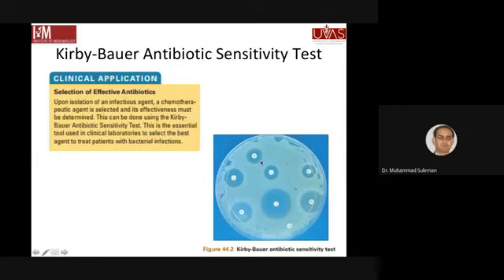Beside जो बाकी सारे antibiotics हैं वो किसी हद तक different kind of efficacy के साथ उसको inhibit कर रहे हैं. So अगर आप hypothetically if you're working in a lab you will give the result. आप इन सारों की जो है वो zone of inhibition report करेंगे, ये भी report करेंगे कि किसको ये resistant है, किसको ये सबसे ज़्यादा sensitive है, and then you will have to measure. आपने जो zone of inhibition है उसका diameter measure करके तो आप उसको मिलीमीटर्स में रिपोर्ट करते हैं कि सबसे ज़्यादा जिसके अंदर जोन ऑफ इनहिबिशन है वो वाली एंटीबायोटिक जो डॉक्टर है या फिजिशियन है वो प्रिस्क्राइब करता है ताकि पेशेंट को जल्दी रिकवरी हो.